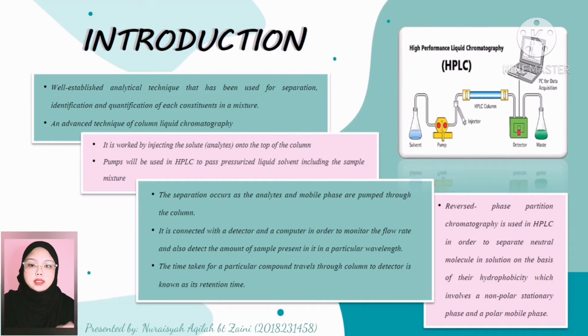It is connected with the detector and the computer in order to monitor the flow rate and detect the amount of the sample present at a particular wavelength, called a chromatogram. Retention time is measured from the time at which the sample is injected until the display shows the maximum peak height for that compound.